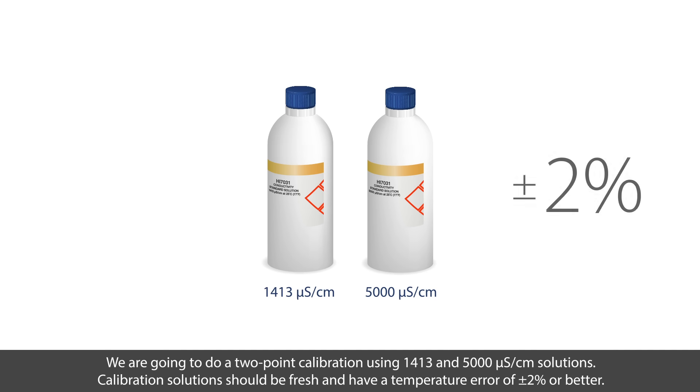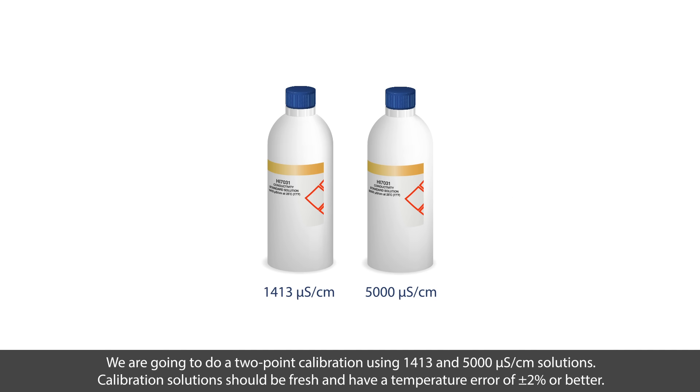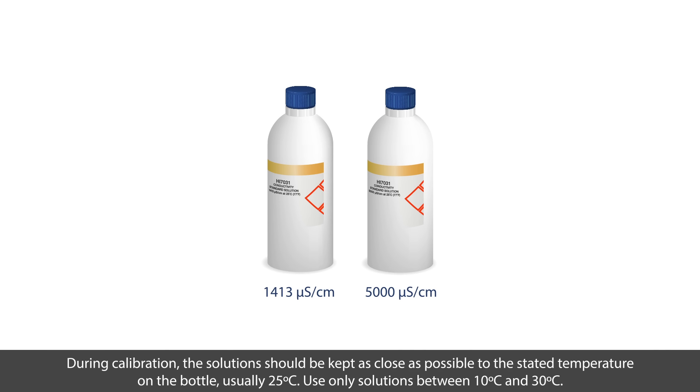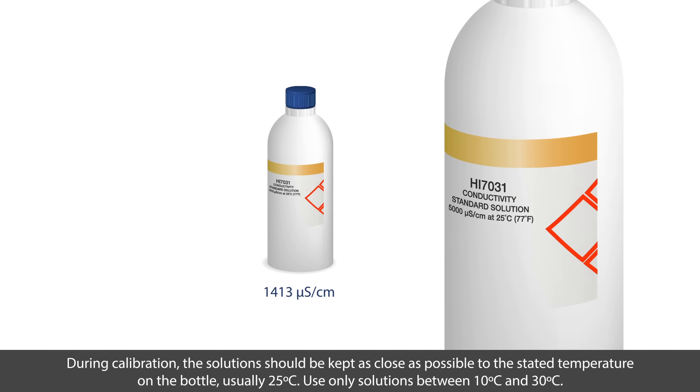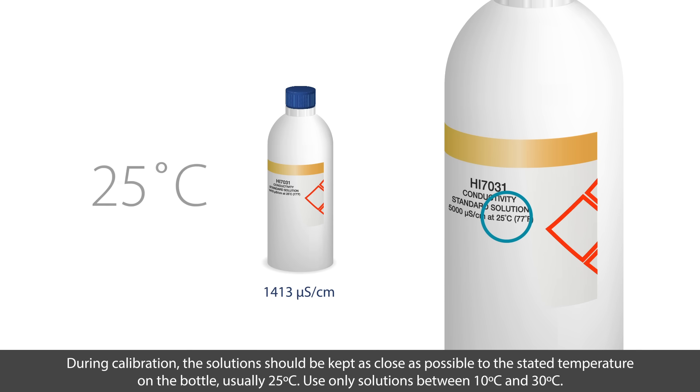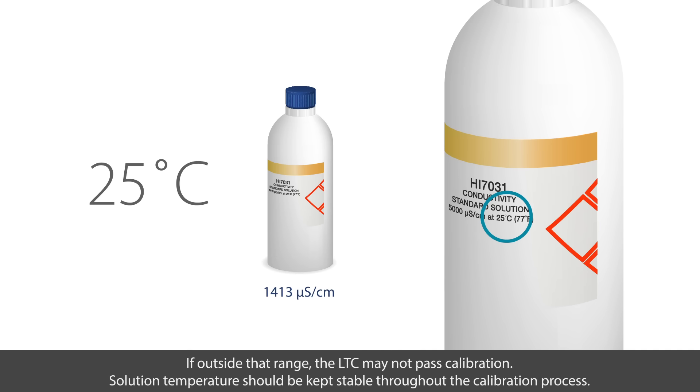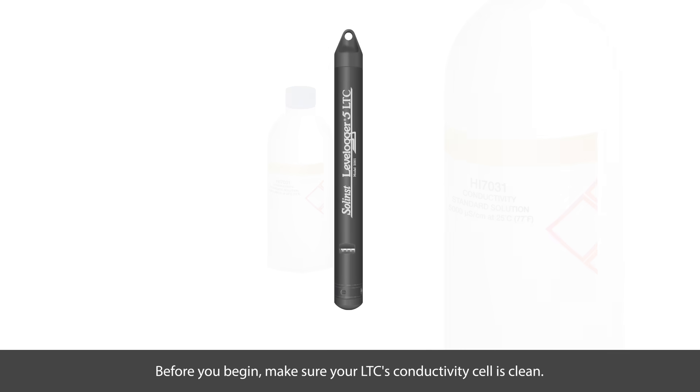Calibration solutions should be fresh and have a temperature error of plus or minus 2% or better. During calibration, the solution should be kept as close as possible to the stated temperature on the bottle, which is usually 25 degrees Celsius. Only use solutions between 10 degrees and 30 degrees C. If outside that range, the LTC may not pass calibration. It's also important to keep the solution temperature stable throughout the entire calibration process.